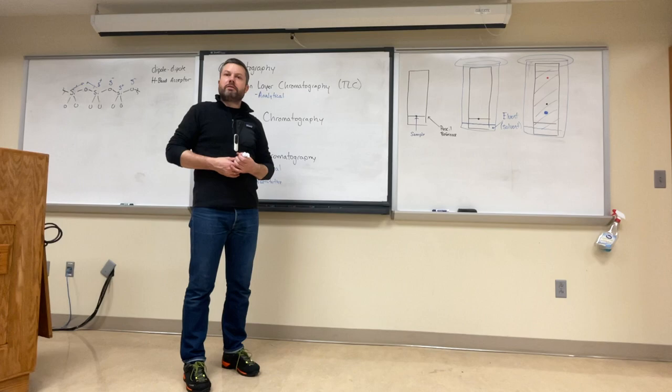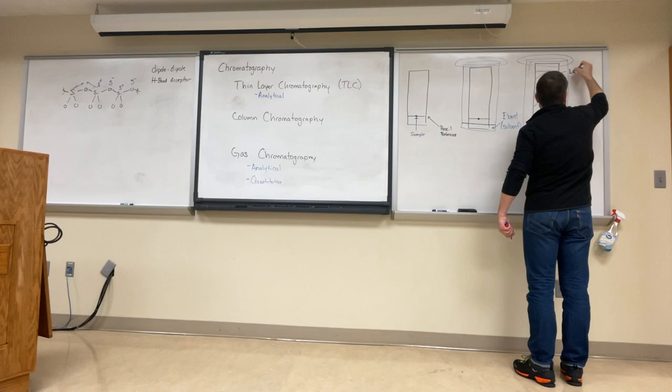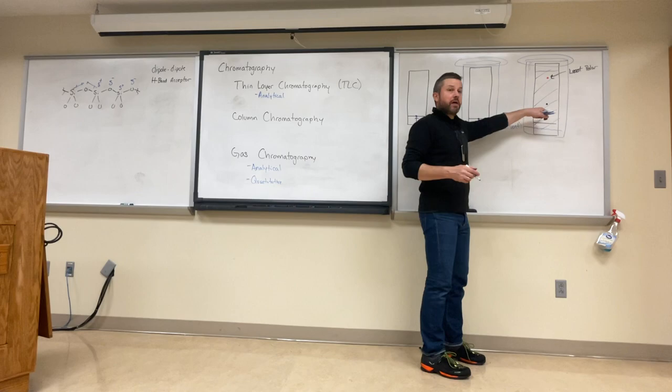I would say the topmost is probably the least polar. Excellent, yeah. Least polar, it interacts the least with the substrate on the TLC plate, in this case silicon oxide. And that would make the bottom spot what? Most polar. Good.